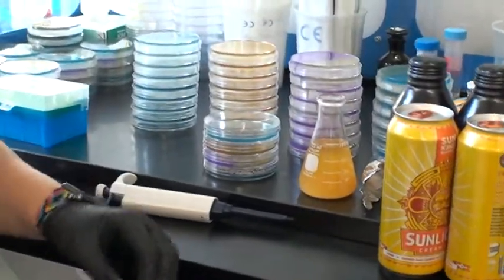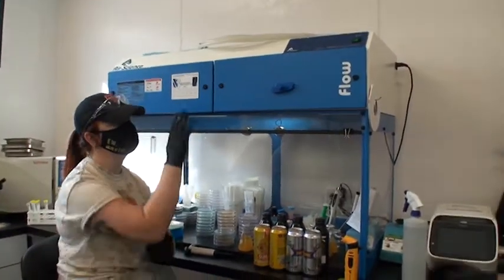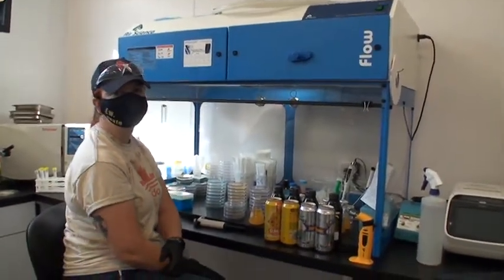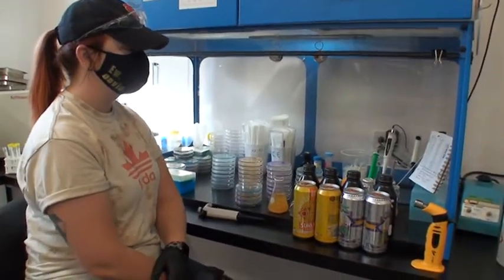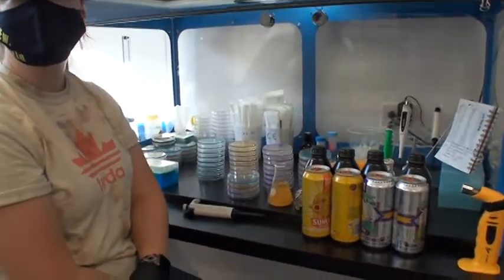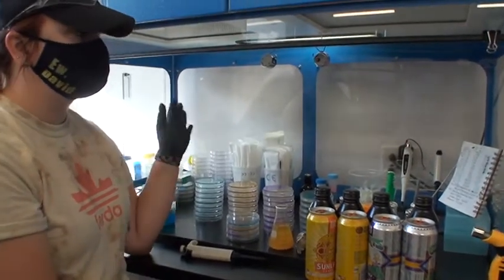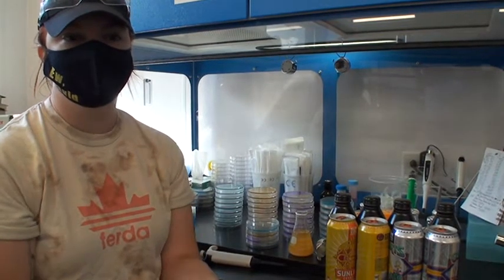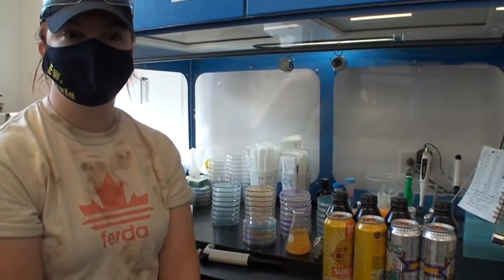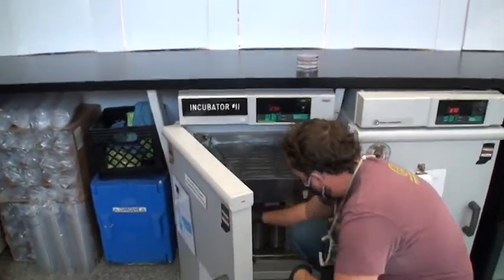We're in a hood here as well, keeping everything clean — we don't want anything falling off the camera in there. After we've plated everything, I'll leave them under the hood for 10 minutes before I put them in the incubator. Then they'll sit in the incubator for five or six days, and then I'll pull them out and check them. We log all of the information in a spreadsheet so we have a record of everything.